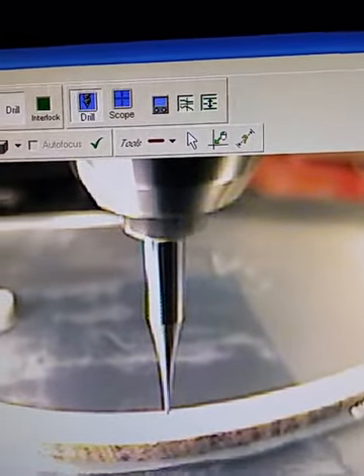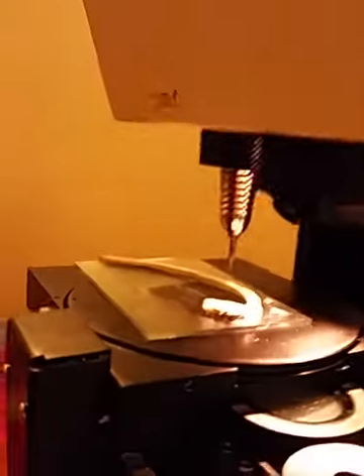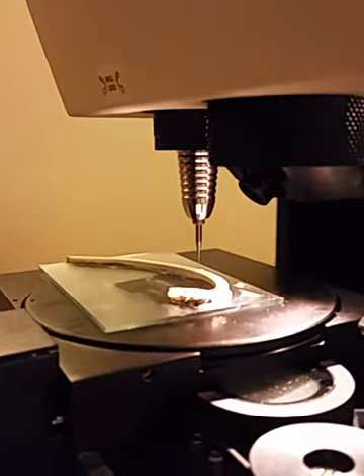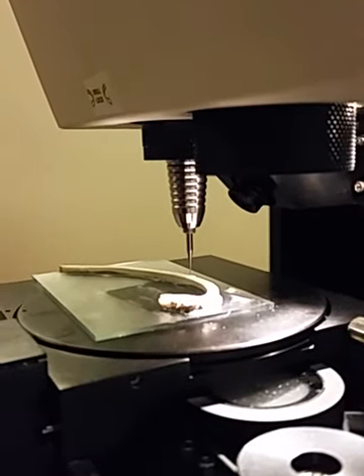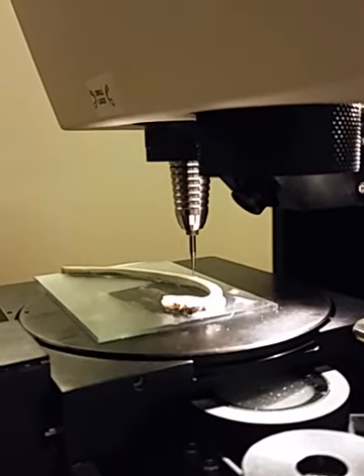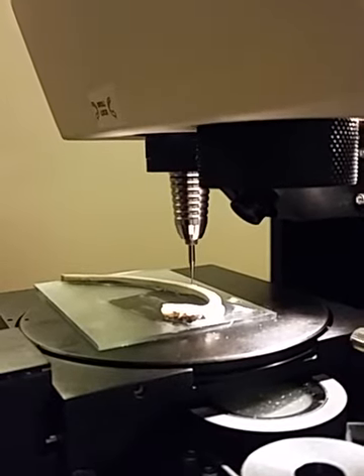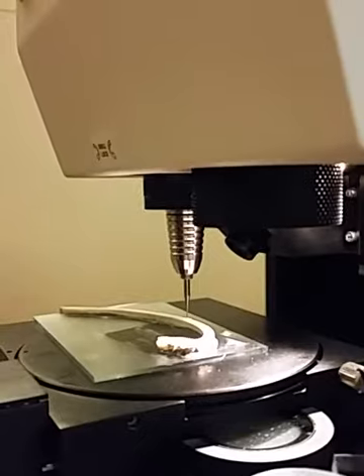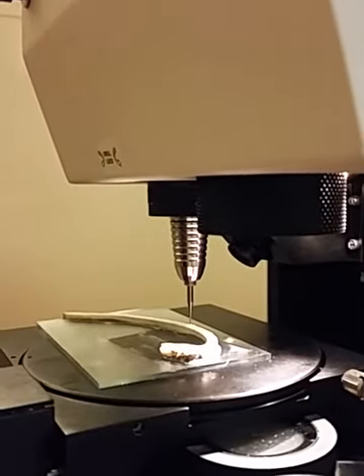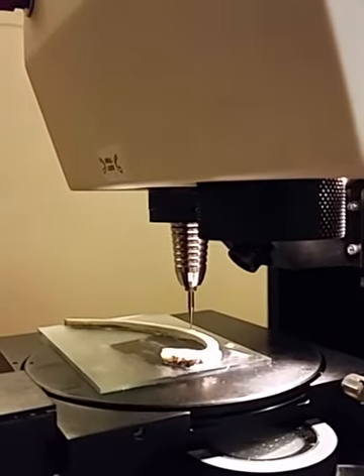So it's done the first scan, it should pick up, go back to the beginning, drop in the same spot, and we'll be able to tell if it's shifted, because it'll make noise at first, because it'll hit the rim. So you hear that? It barely touched the edge, so that's good. Most of the drop was in the trough.